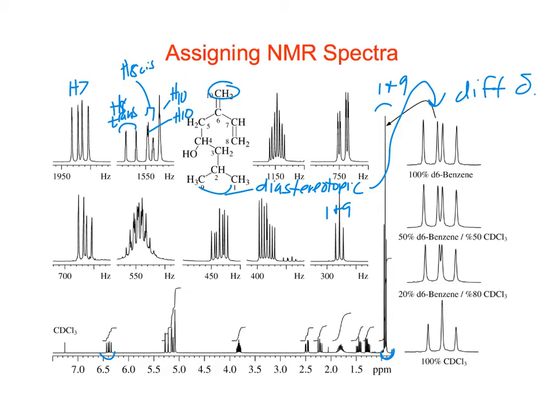All right, so we got all of the double bond protons then. What's the next easiest to assign? CH4. I was going to say CH4, probably the next one, the H4 next to the oxygen, right? Where's that going to be? I would say it's probably the 3.8 because look how big it is. So this is going to be H4, right? Because it's next to oxygen, so it has to be, it's a 3.8.